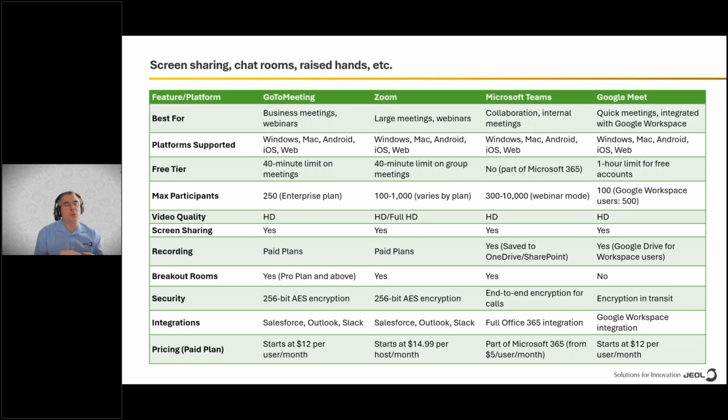Another point is which sort of software should we use if we want to train people? So from the facility manager perspective, imagine you've got a cohort of 20 or 30 undergraduate students and you want to show them how a transmission electron microscope works. Which software packages could you use to do that?